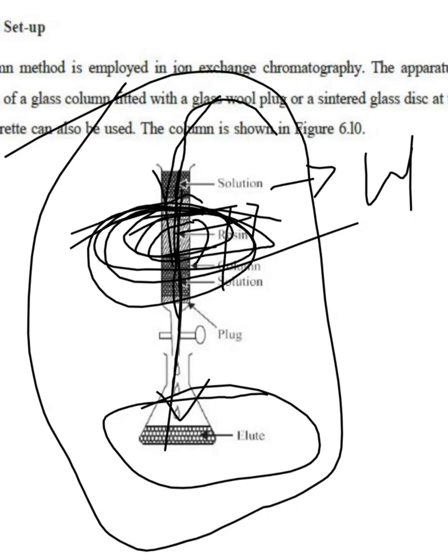It won't be having any contact with the stationary phase. So the stationary phase should be well bonded and it should not be dry. This is the main criteria while using stationary phase in the packing columns.